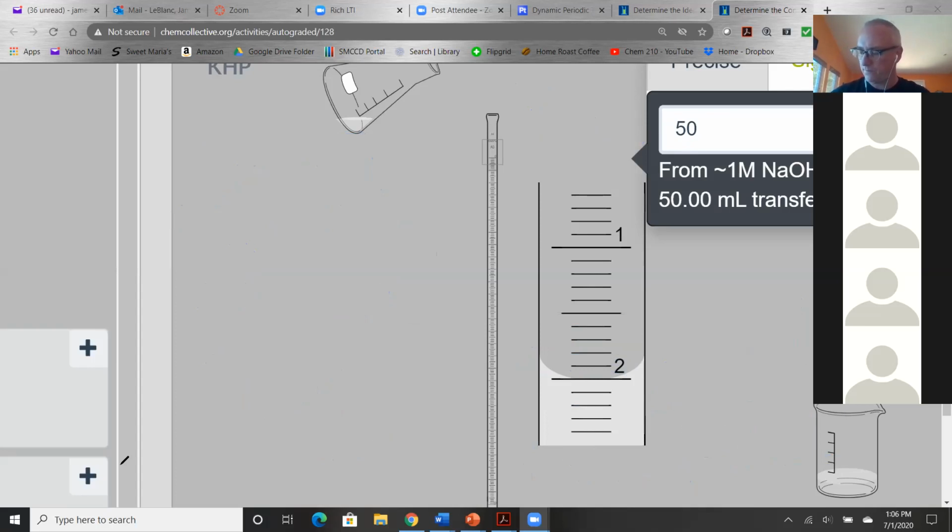So I have a question. How do you know to pour in 50 mL? It's a 50 mL burette. So 50 mL is a good estimate, right? The burette holds 50 mL. So we pour in how much the burette holds? Yeah, you might as well. There's no point pouring in 100 because it'll just spill everywhere. So yeah, I just poured in the volume it holds.